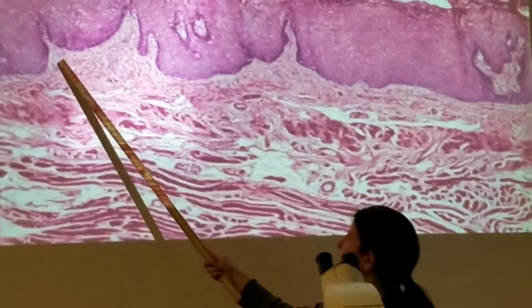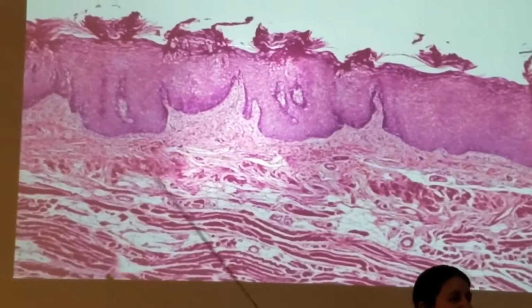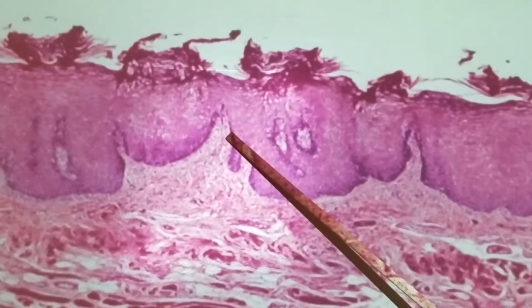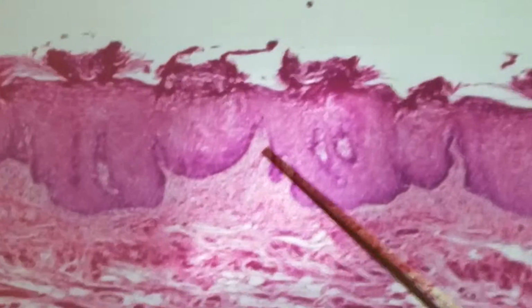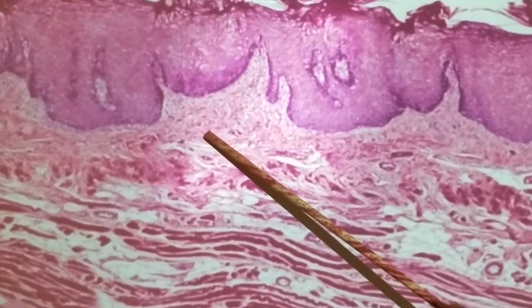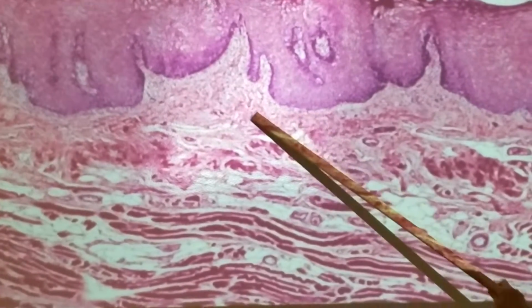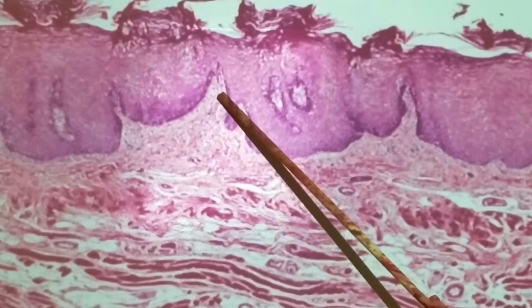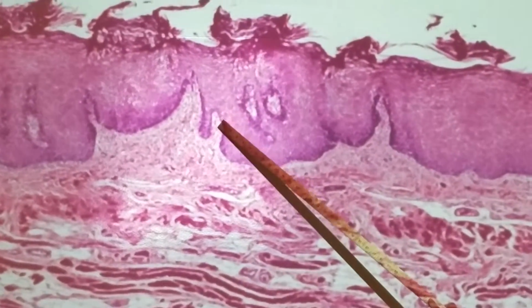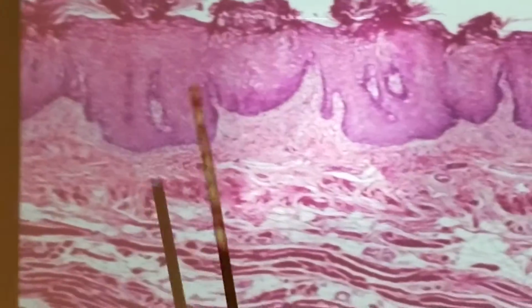That's all of this. All this is lamina propria. The problem becomes, that's the filiform papilla. If it's pointed to one of these things, and it says what's the pointed projection at the end of the pointer, that's what you're looking for, the filiform. If it's just stuck down here, it's just going to be lamina propria. More than likely, filiform will be your choice. Lamina propria does go up in here, but to distinguish between the two structures, pointed projection is the key phrase. Any of these pointed projections would be the filiform.